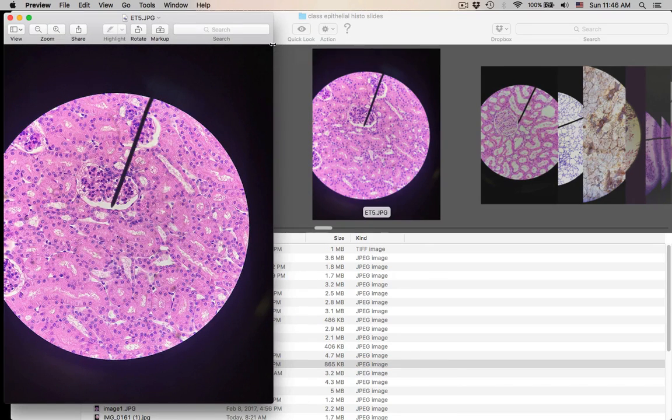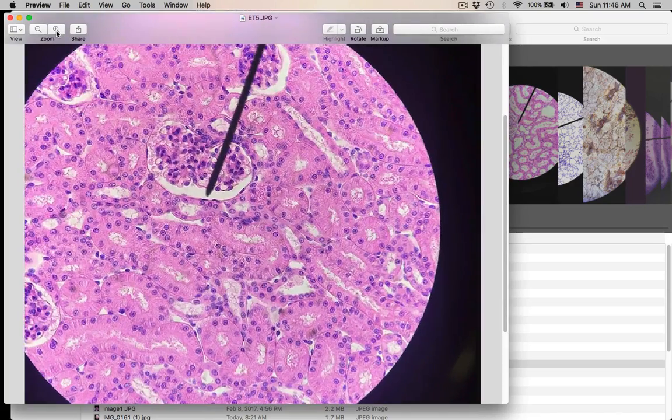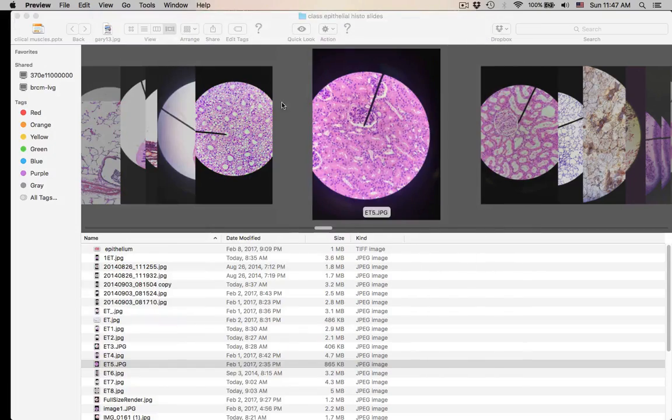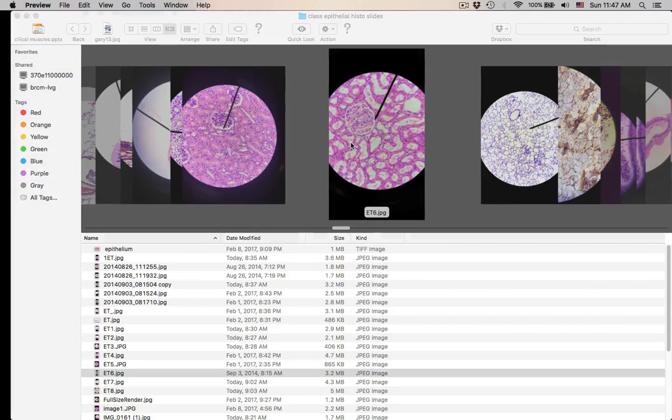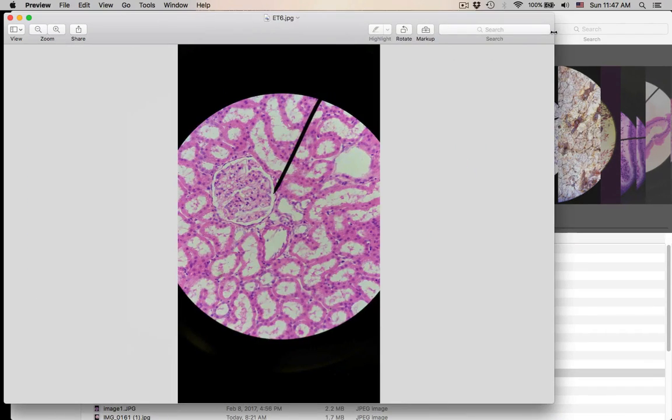On this guy, number 13, the pointer is in the lumen. This is simple squamous going all the way around here. See the flattened nuclei here? One layer thick, simple squamous. That was 13. Number 14, similar slide, taken from the same organ. So the question for this guy was, what organ do you find this in?